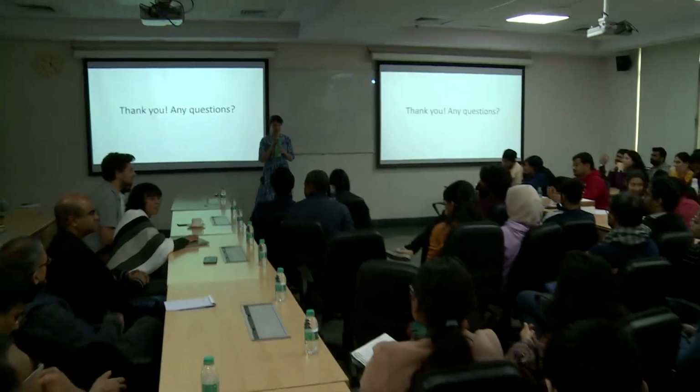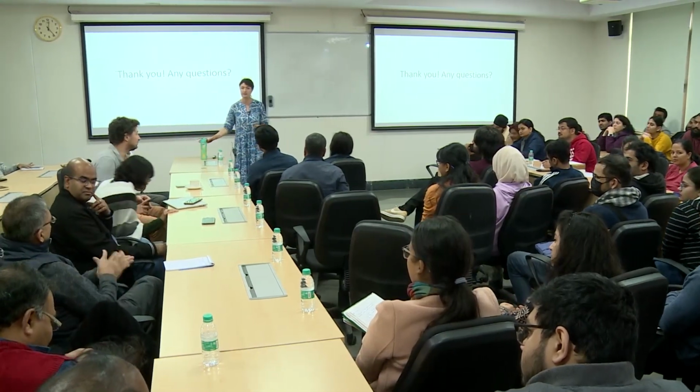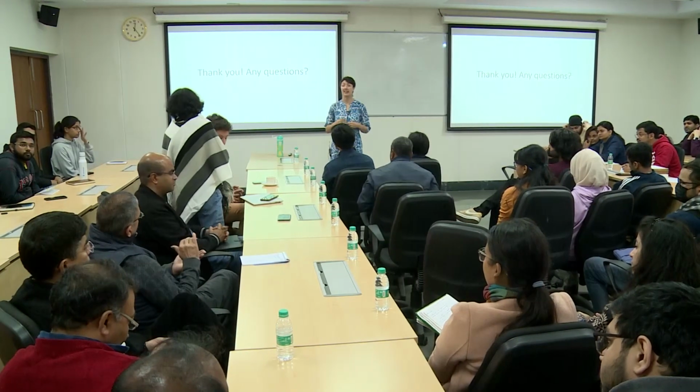Any questions? So one of the questions: you said in grid preparation that we don't know how those things behave. If we put some polylysine or something coating on the grids so that they take only one kind of orientation, what happens? Yeah, it's a great question.